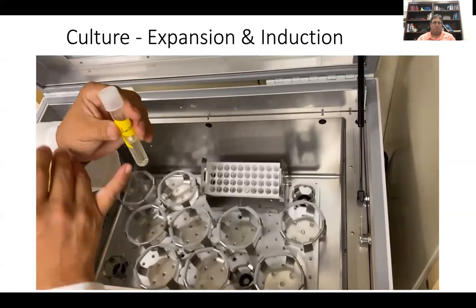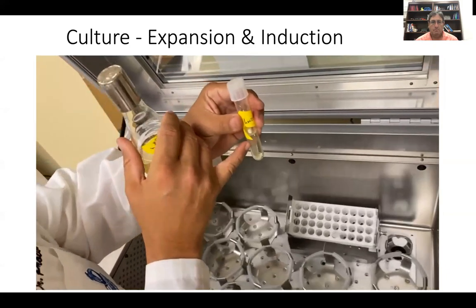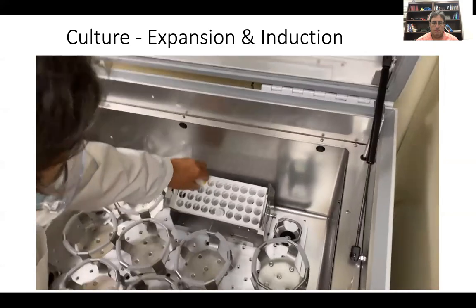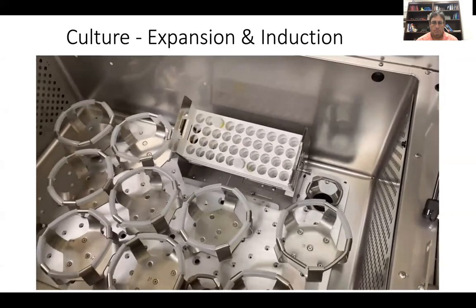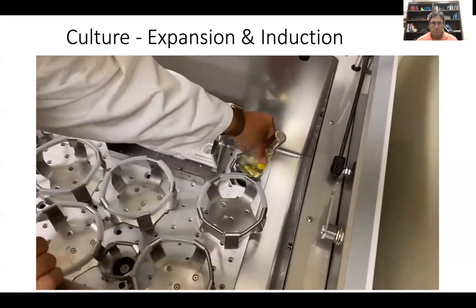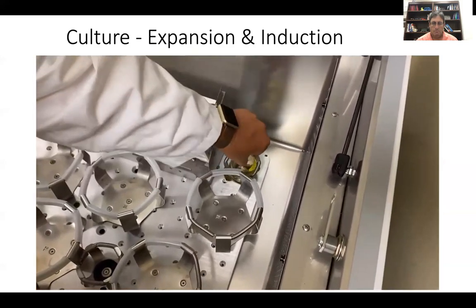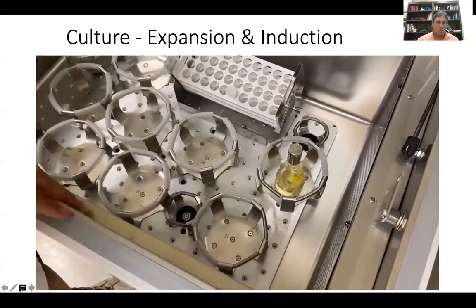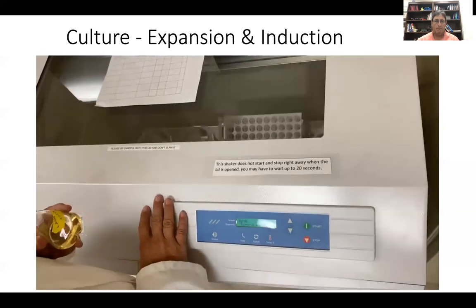For tubes like this, you want less than half full, a little bit less is better. This is 5 mils in this tube. Simply put them in this holder here, so it's set at an angle that keeps the liquid moving and aerated. Then find one that fits. See how this doesn't fit? That's not the right size, so we need to find the appropriate size for that. There are folks who use tape and other things to make it fit. Don't do that. You're just asking for a mess to happen.